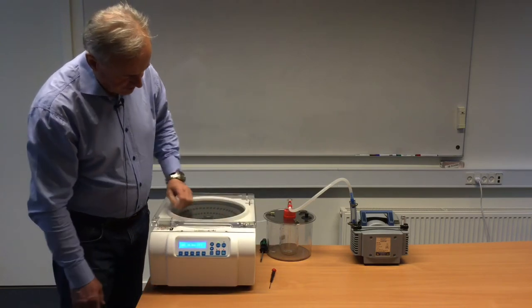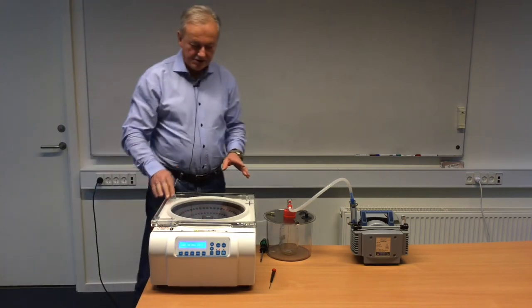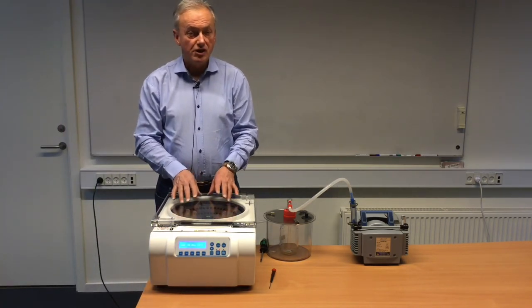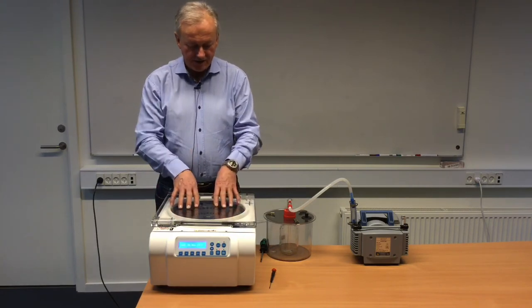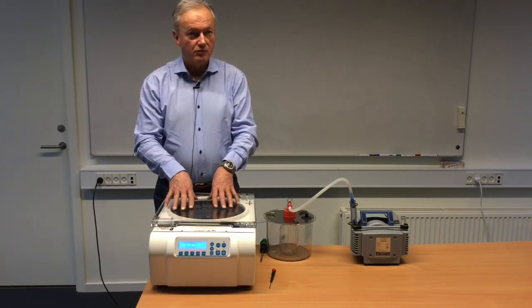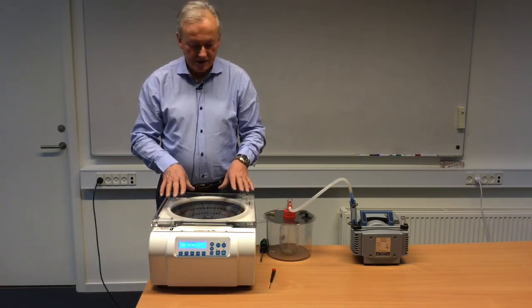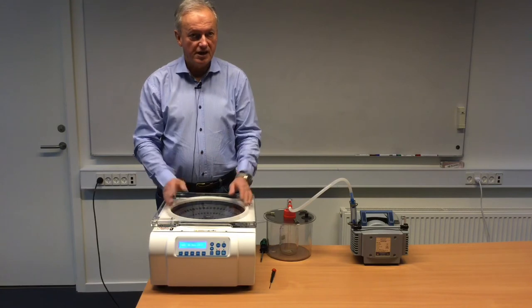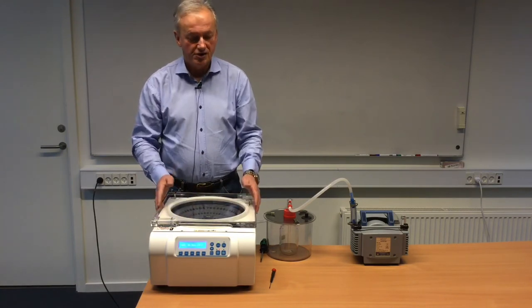Then close the lid and start the rotation. The reason we can change the set point to plus 5°C is that if we have a pre-cooled rotor and sample — let's say at 5 degrees — and we attach that to the ScanSpeed, the sensor will measure that it is cold and will try to activate the heating. To avoid that, we give the set point plus 5°C, and it will equalize without starting the heating until we change the set point to another chamber temperature.